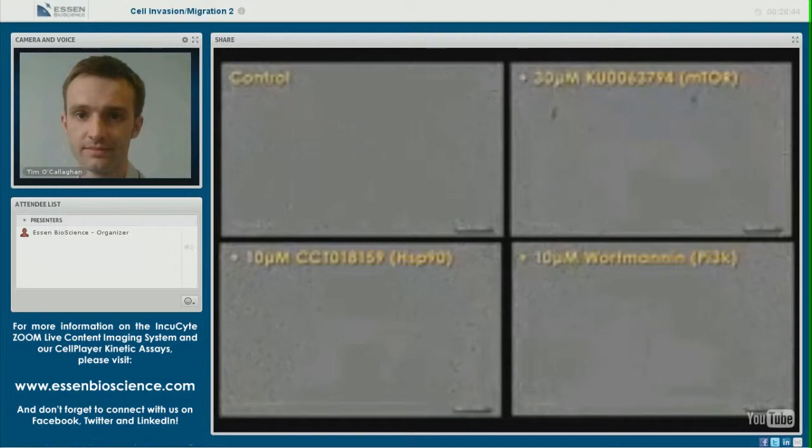However, closer phenotypic analysis of the images shows that the cells may be more hypermotile in the presence of this mTOR inhibitor, and also the directionality of migration may be lost somewhat, and perhaps these phenotypes are associated with the low level of inhibition observed for this compound. Of course, further phenotypic analysis would need to be performed to determine this, but it's an interesting observation nonetheless.